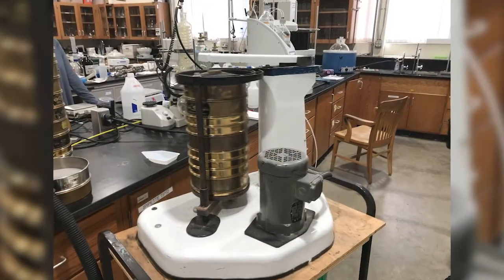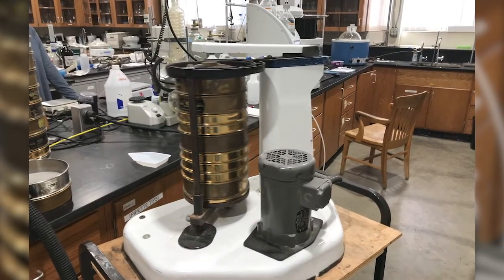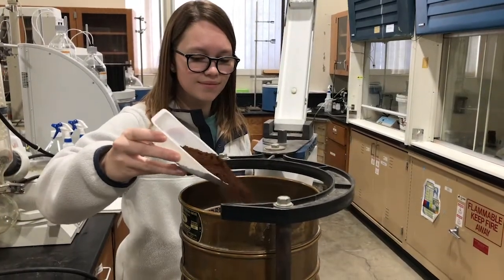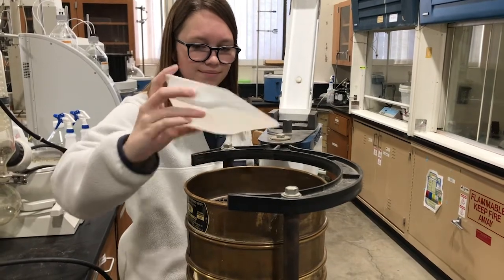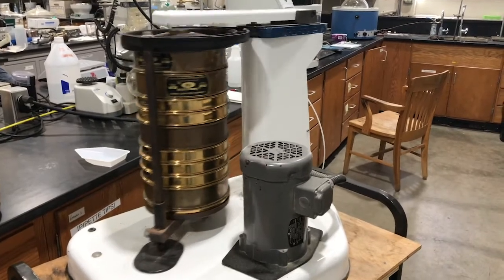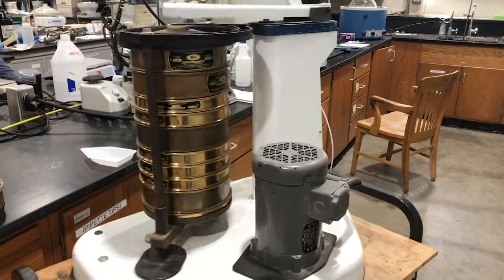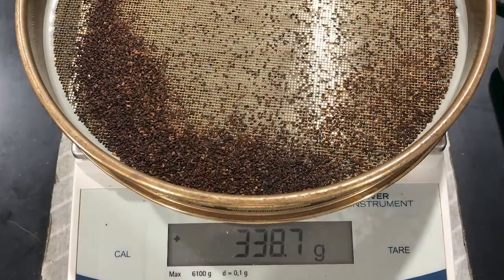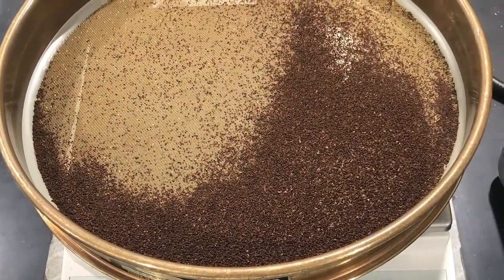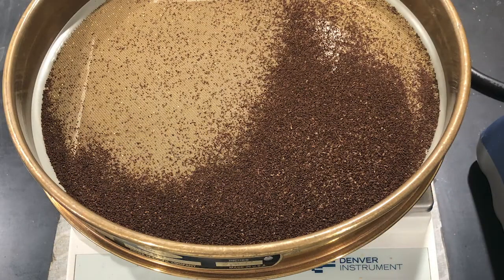We then used this sieve machine to sieve the pre-ground coffee grounds to get a particle size distribution and measure the size of the different grounds within our samples. After running the sieve machine, we took the mass of each sieve again while they were containing the ground coffee. We repeated the sieving process with the self-ground coffee and obtained the final mass of each sieve.